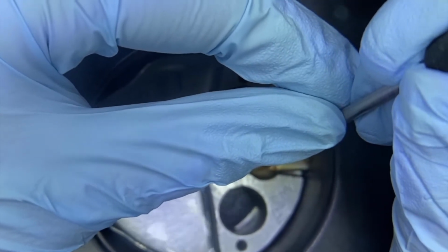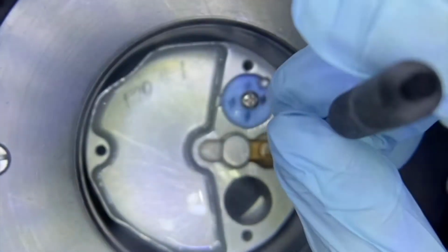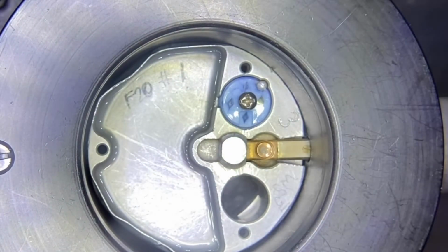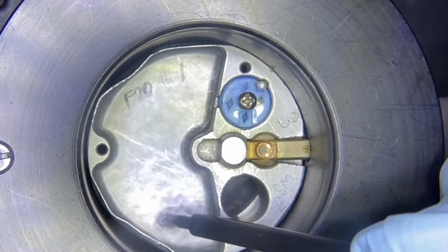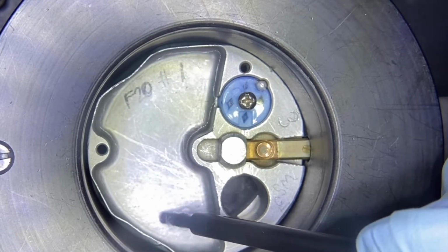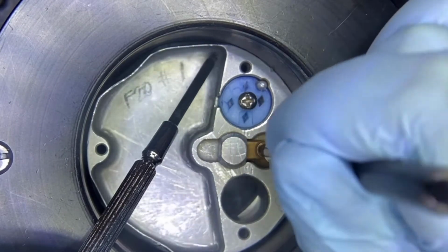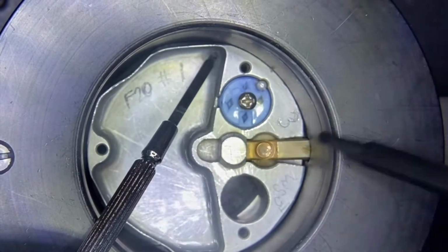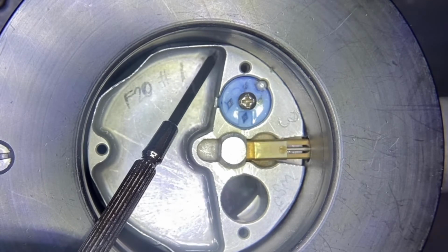Using the butterfly tool, release the clip ring on top of the stage. Pull down the stamping tool. And your screwdriver. Apply a little bit of pressure until you hear a click to secure the clip ring on the stage. Close the shutter.